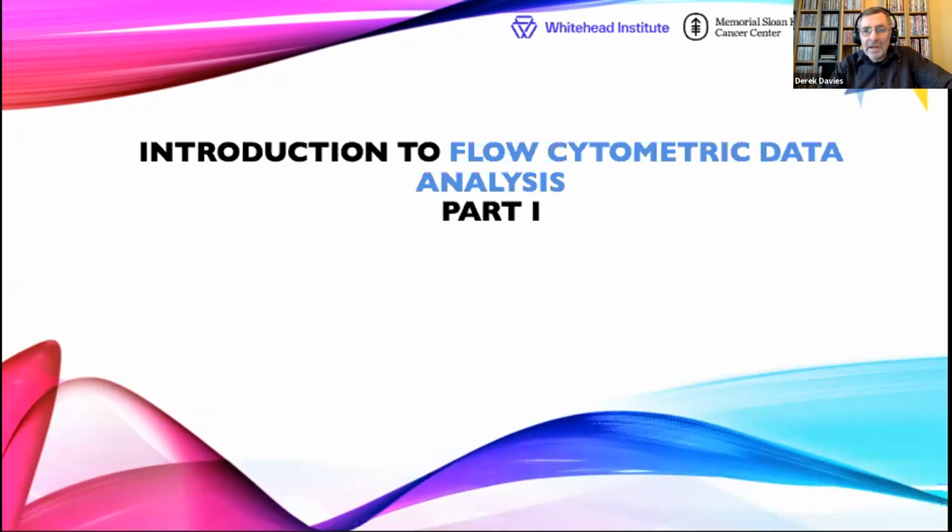But data analysis in flow cytometry is extremely important. Now, you're asking a biological question and you want to get an answer by flow cytometry. Your data file may contain that answer within it, but you have to dig for gold, if you like. Sometimes you have to do some panning to find the right answer within there.